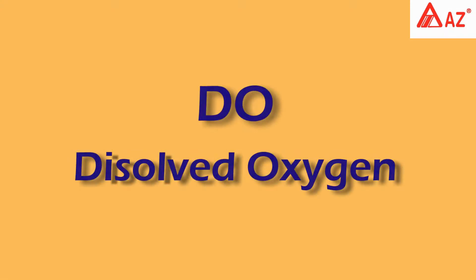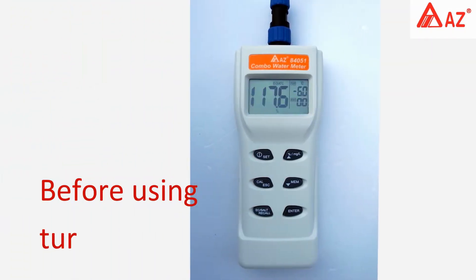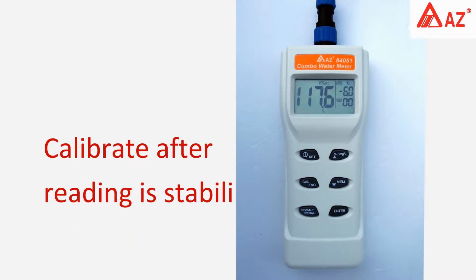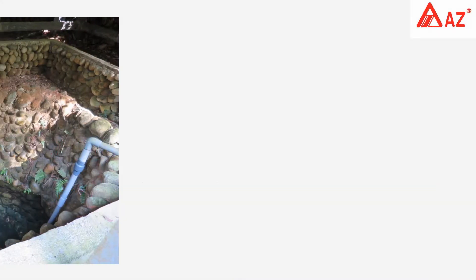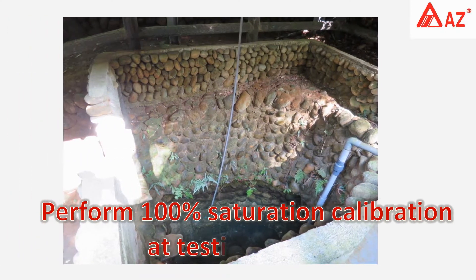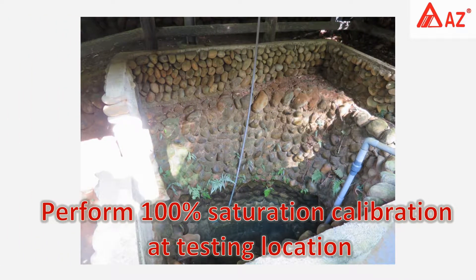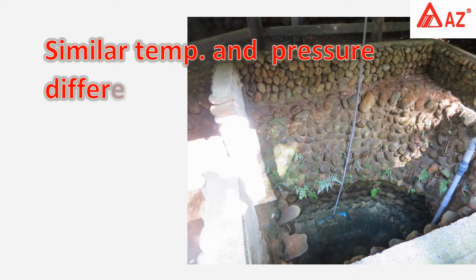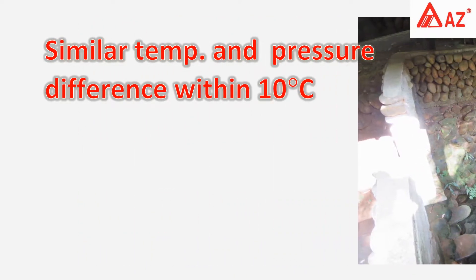For dissolved oxygen calibration, turn on the meter for 5 to 10 minutes and calibrate after the reading has stabilized. Before each operation, perform a 100% saturation calibration at the testing location or in a similar temperature and pressure environment. Temperature difference should be within 10 degrees Celsius.